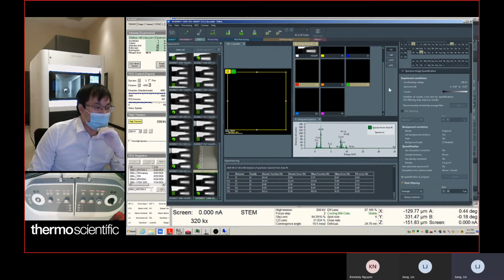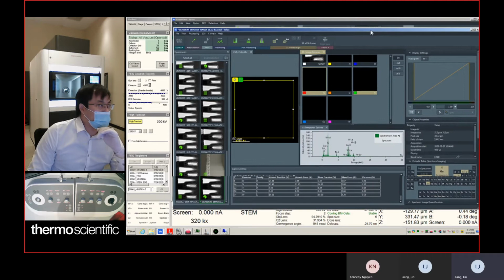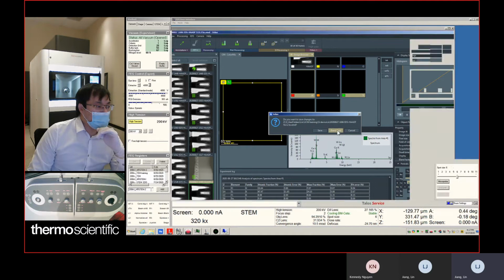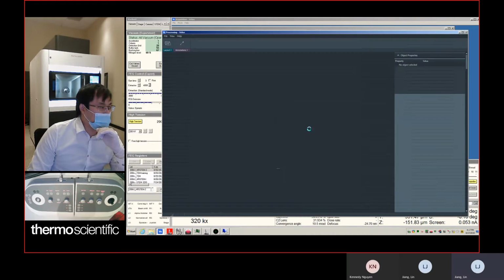I think it's getting very slow. We might need to close it. Bring it back. So I think it's closed. It's going to close, and usually we wait a little bit, and once it's good, we just open it again.